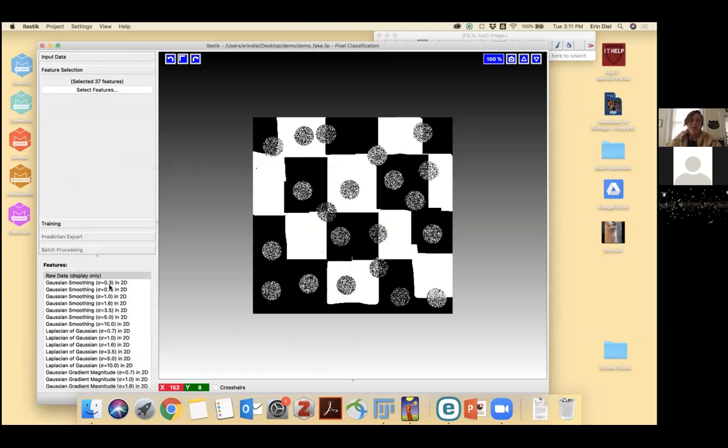And then what you're able to see is now I have this big long list of images. When you originally load in data, you have the raw data, and this is what we are used to thinking about using for image segmentation. So here's my raw data. It's a bunch of gray values arranged in this grid. And I'm going to pick a threshold and say, okay, anything above that value, I'm going to keep. But now these features are how I've gotten extra information about each individual pixel.